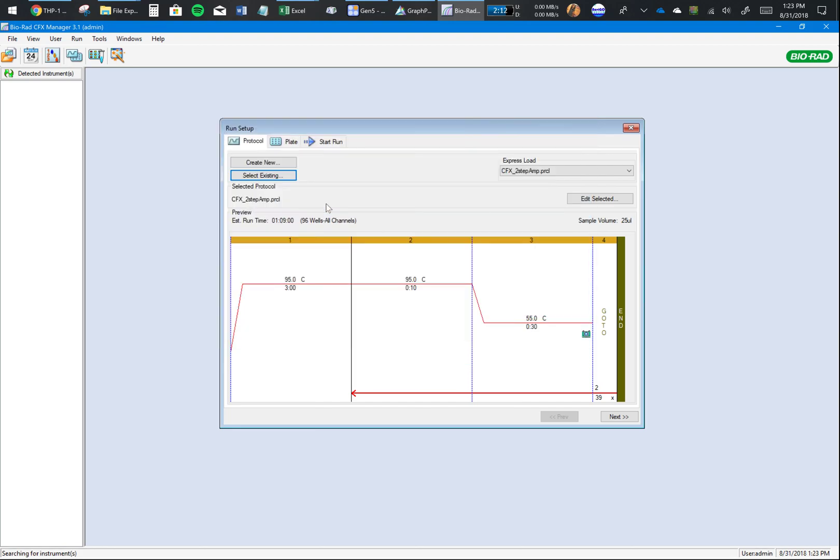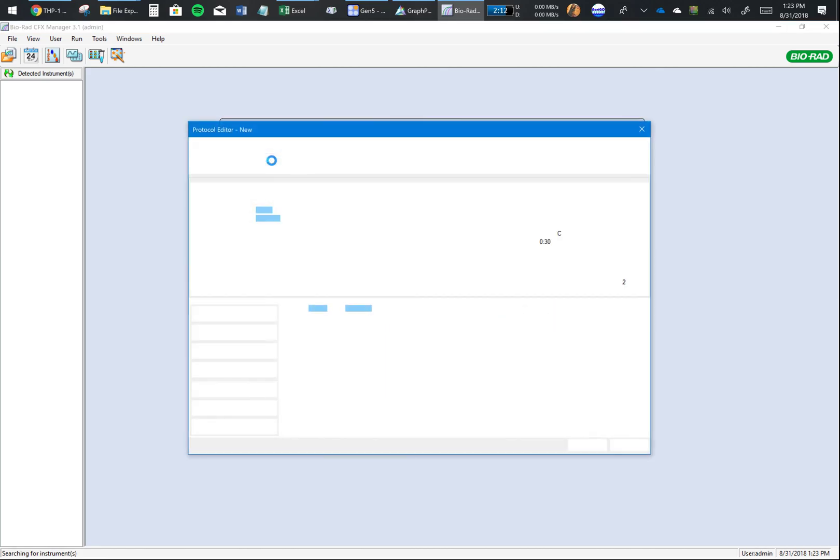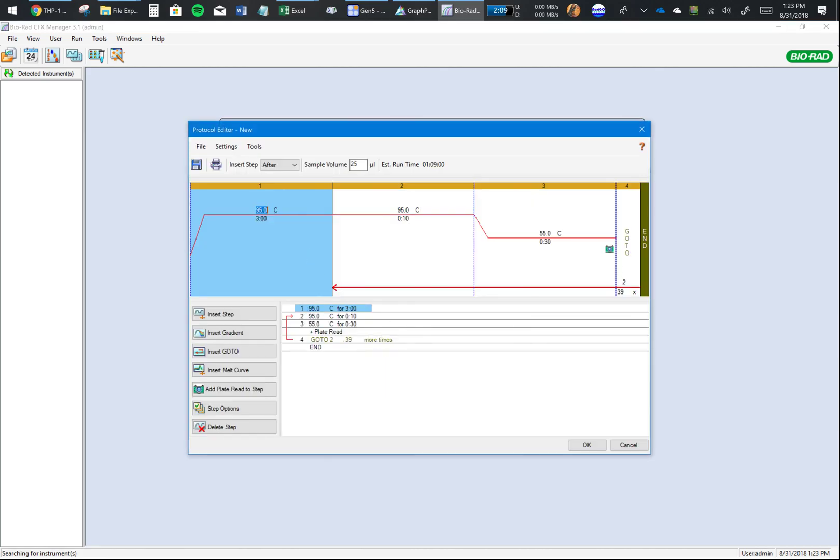That's your protocol. In the rare chance you don't have a protocol already and you want to make one, you would go and click on Create New.